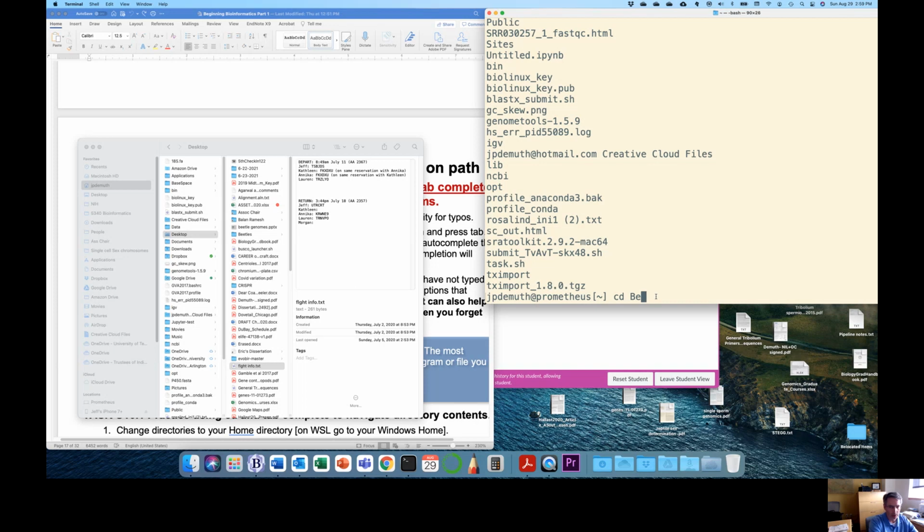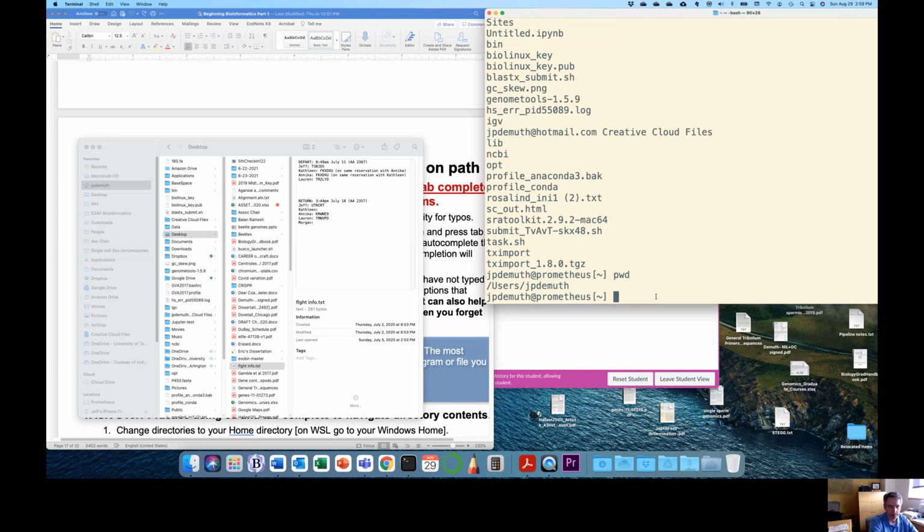And then I think, well, that's weird. That /be, oh no, it's not under the root. So that would be a situation where I don't know where I am. So I do pwd. Oh, I'm in my home directory. So I need to go to Desktop. There we go. So the tab complete helps me figure out the path because it will only work if the directories exist in the place where I think they do along the path.